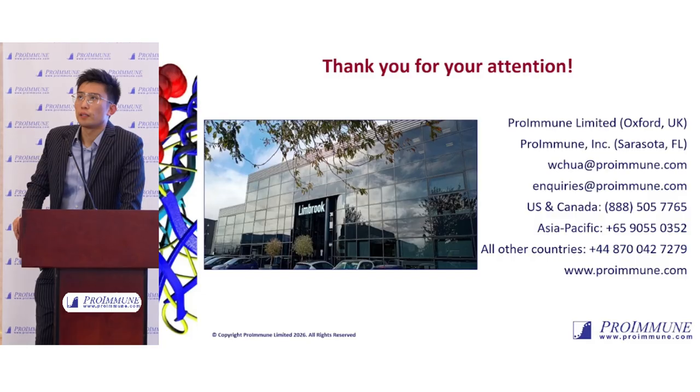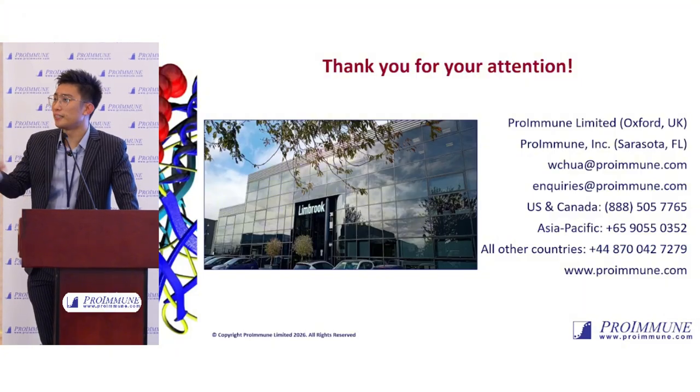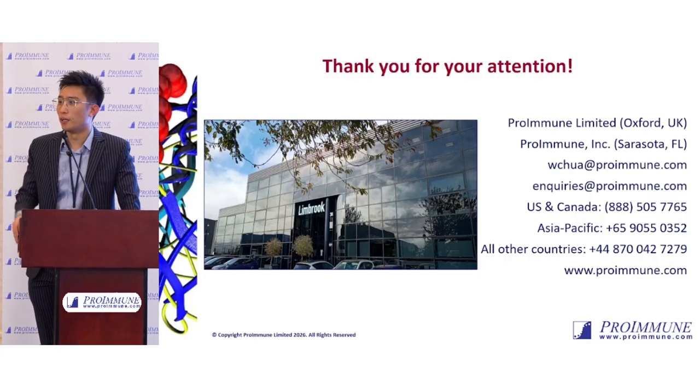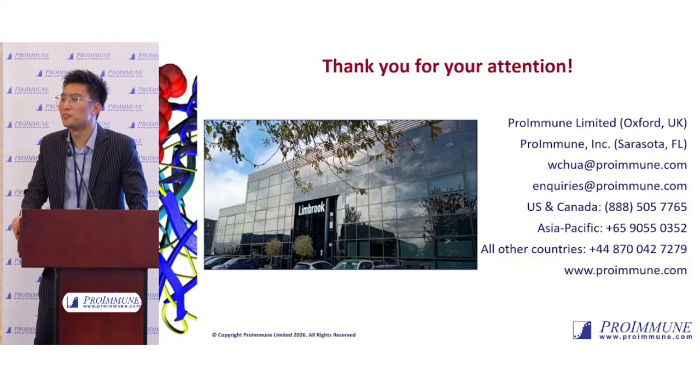Right, that's a good question. So for this particular part, I understand the question, but I don't really have a good answer to it, because it really comes down to what level of understanding we have of the drug molecule itself, and we have to think about the drug mechanism to understand why this happened. Is it something that's expected or intended? Because sometimes when you see a cytokine response, it doesn't necessarily mean that it's immunogenic. It could be part of the mechanism. So I don't really have a good answer to that at the moment. It really depends on the drug itself. So maybe I can try to answer that.